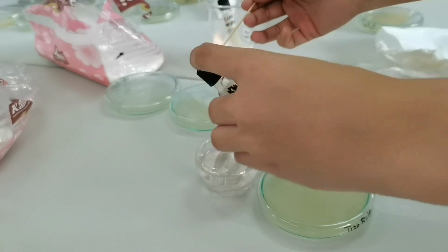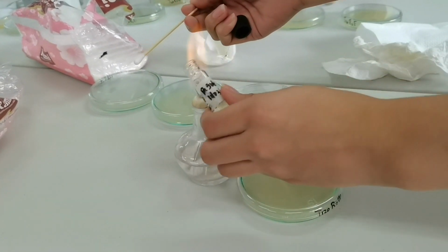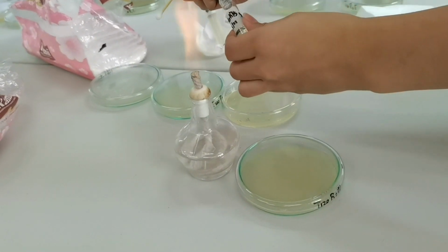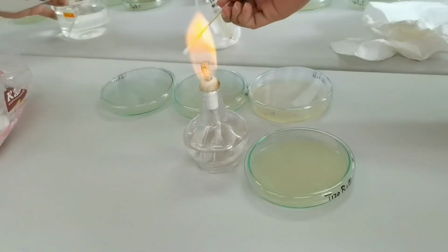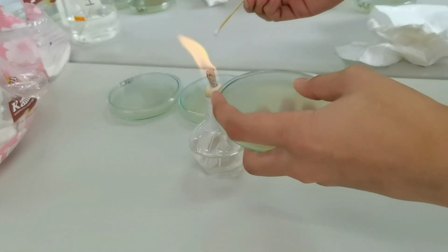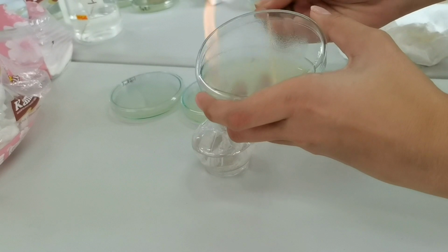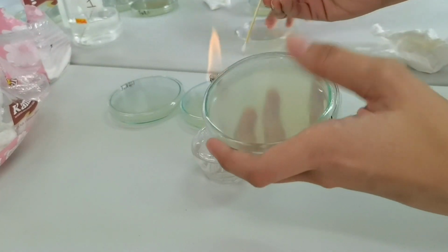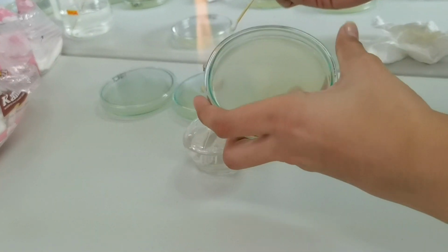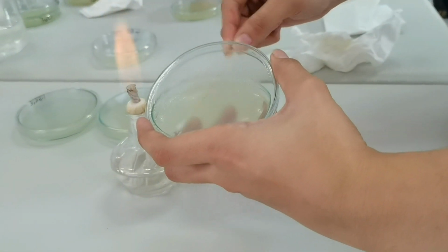My students are starting this experiment by swabbing their test organism onto culture medium in petri dishes, like what you see here, and they are using the aseptic technique to make sure that contamination is prevented or avoided.